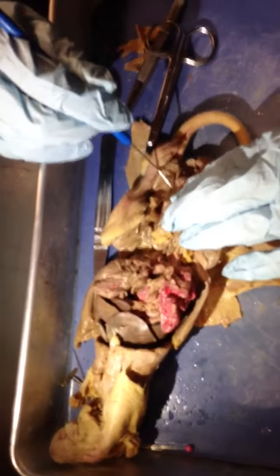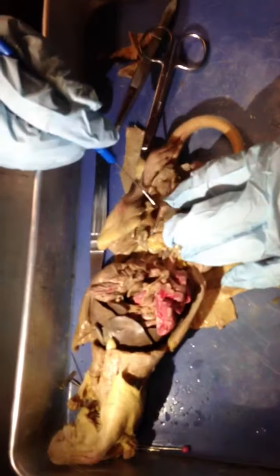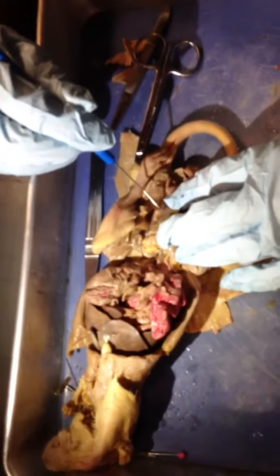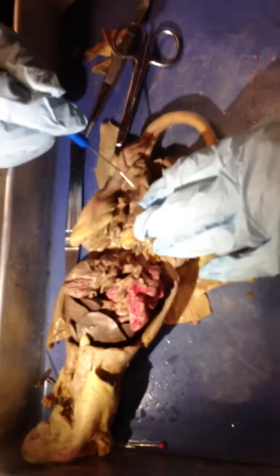Which cools your sperm down, right? Mm-hmm. Yeah. And so this is your vas deferens. Is that it?